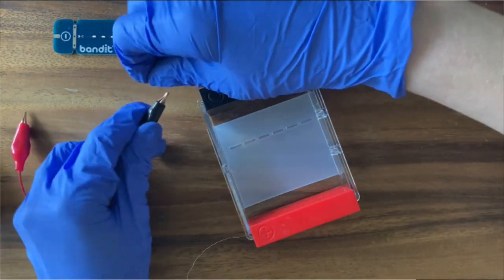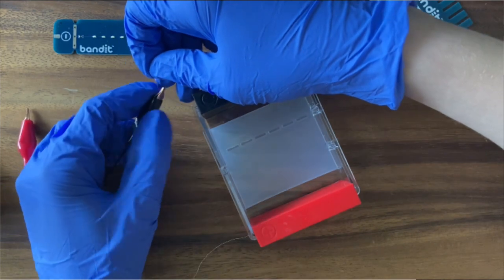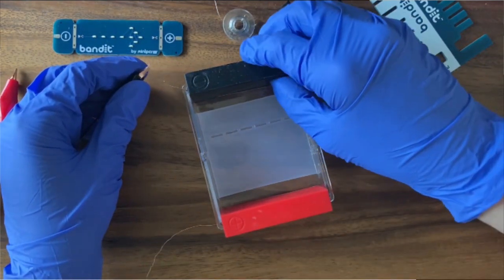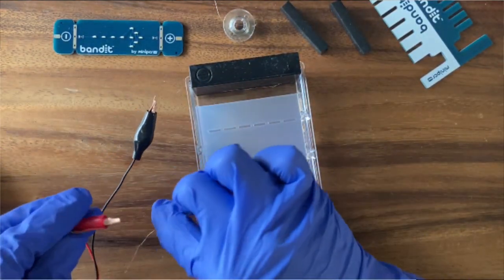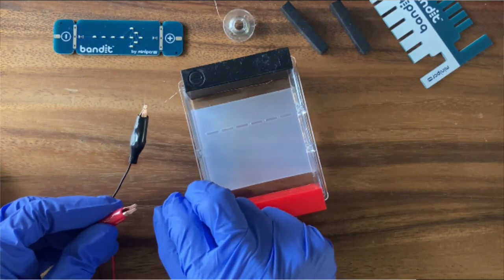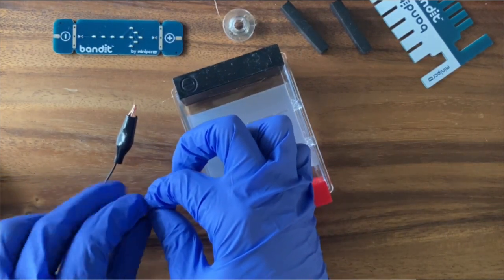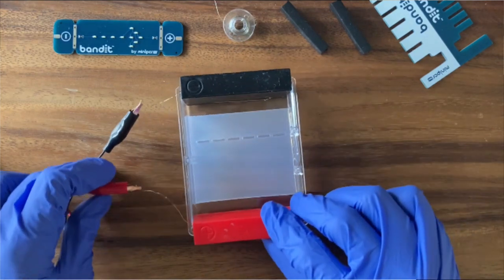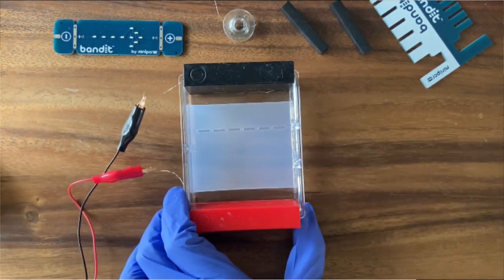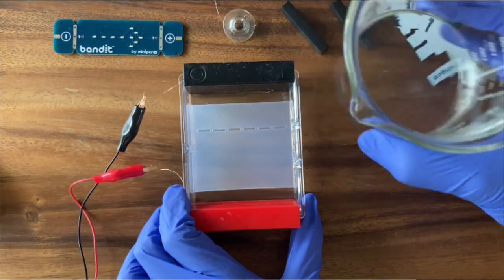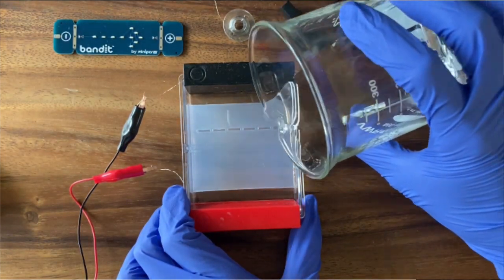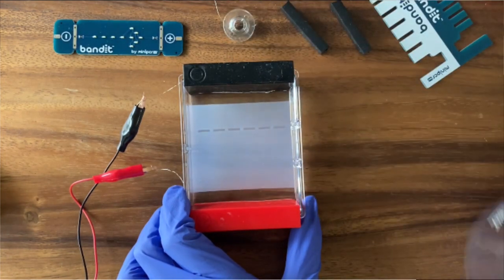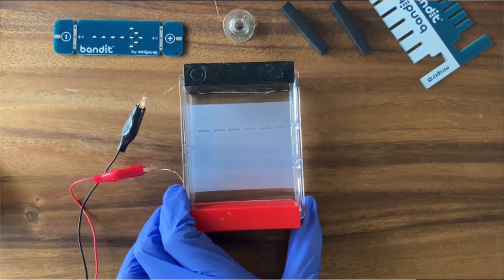I'll grab my alligator clips now, which are what's going to carry electricity into my system. We'll clip that black one on and then I'm just going to wrap the free end of the wire around a little bit to make sure I have good contact there. Then I'll do the same with the red one. Now we have to complete this circuit, and so I'm going to pour buffer over the gel and the electrodes and that buffer is just going to conduct electricity throughout our gel. That completes our electrophoresis circuit.